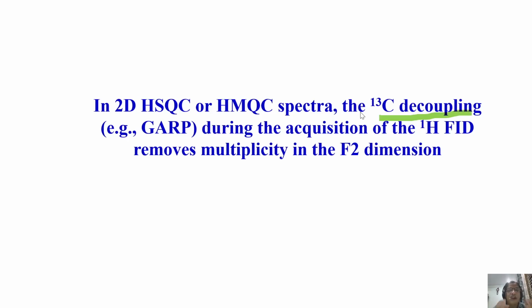So what will you expect in the HSQC spectrum? The two doublets you saw are satellites that now merge and give a single peak at the center. Where you see only a single proton peak, you are going to see a correlation peak. That's all. Only thing is the splitting is removed. The coupling is removed. No more splitting. You will get correlation at the respective chemical shifts. Coupling information is absent. You don't see additional splittings in the HSQC spectrum.